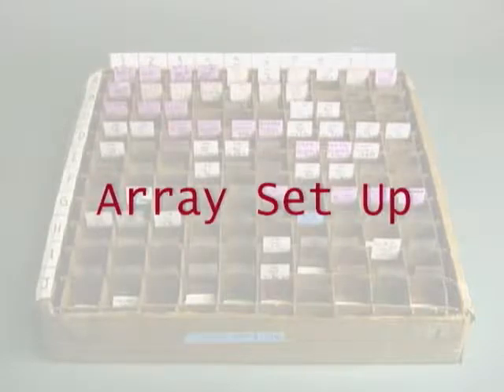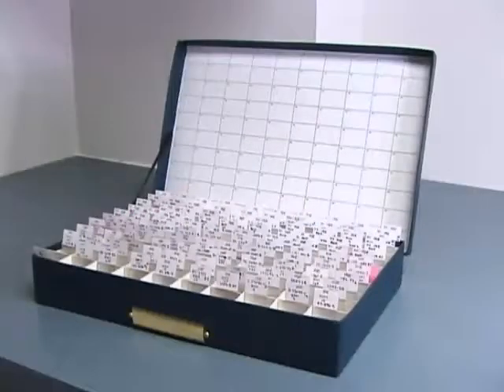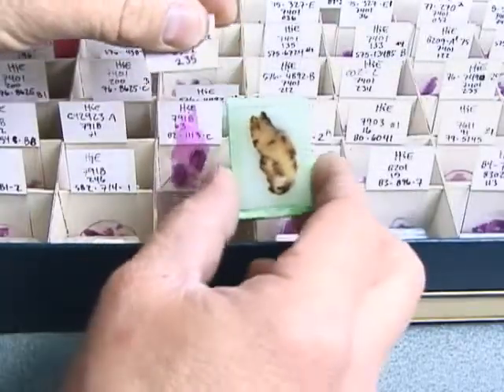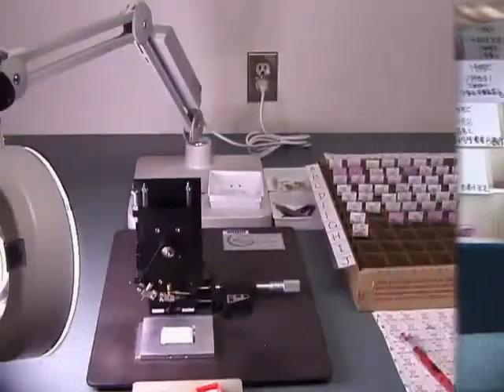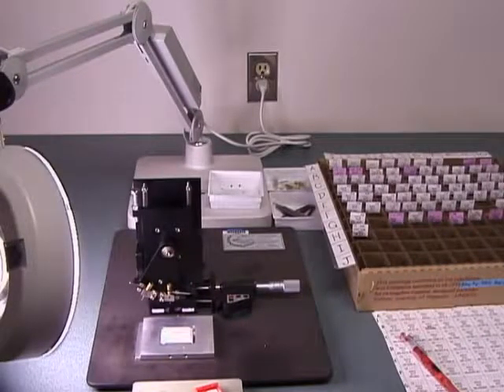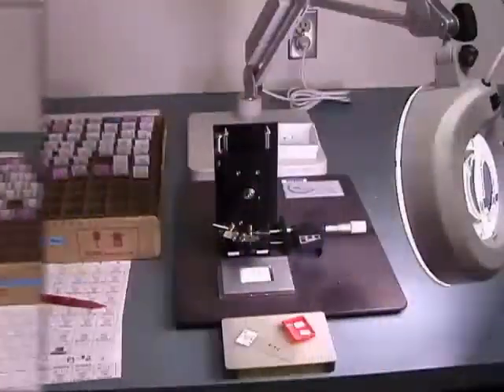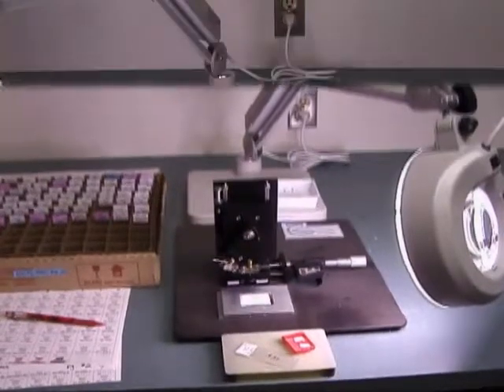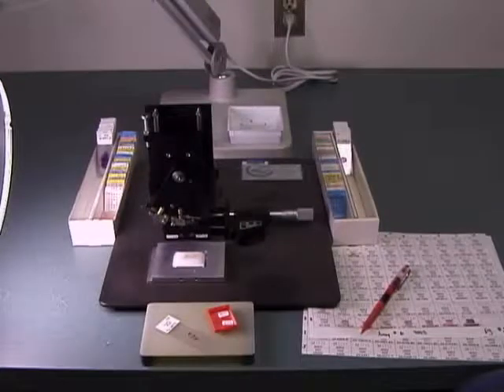Before punching an array, it is important to organize donor tissues into a grid-type system. A grid system will help the array puncher to keep order to hundreds of blocks and slides used as donor tissues. With a grid-type box, both the donor slide and block are kept together. When punching an array, try to develop a system of consistency. If you choose to use slide boxes, keep them separate so as not to confuse which box you are punching and which you have already punched.